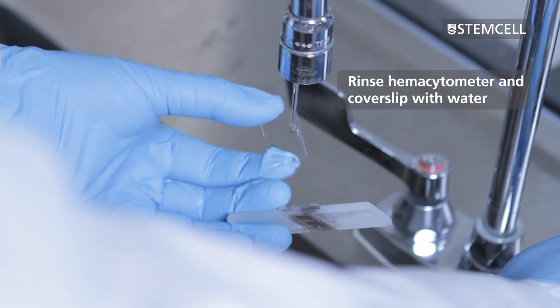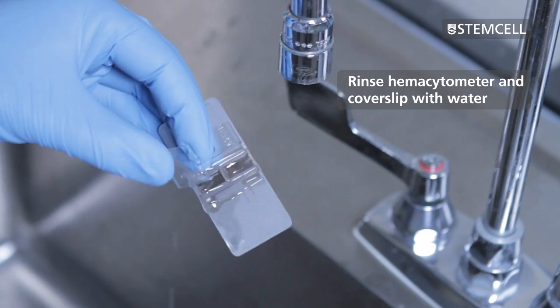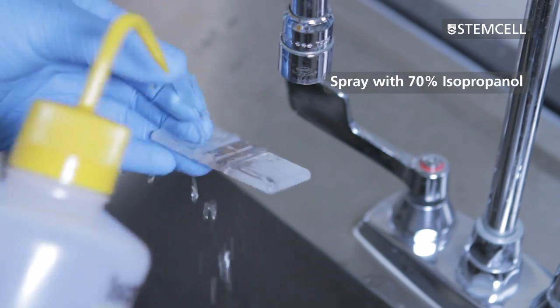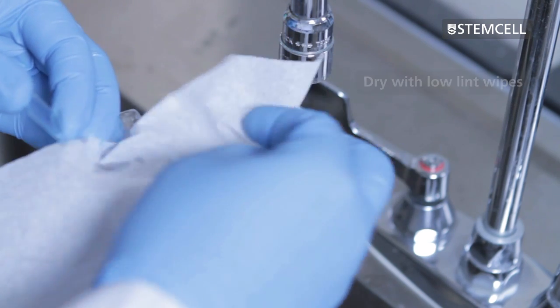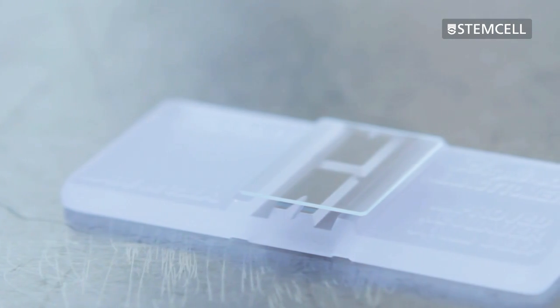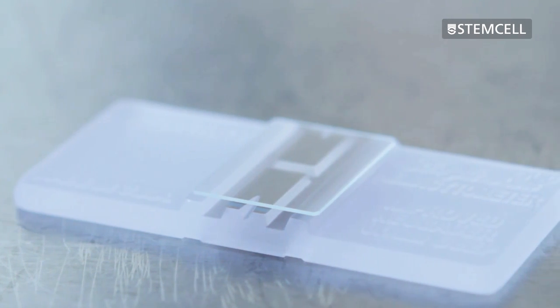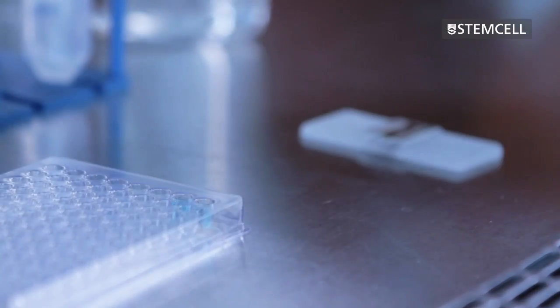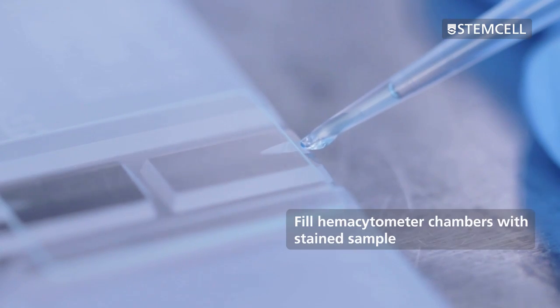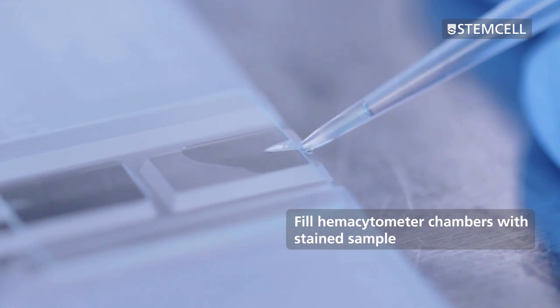Clean a coverslip and hemocytometer by first rinsing it thoroughly in water and then spraying it with 70% isopropanol and drying it with low-lint wipes. Place the coverslip onto the hemocytometer so it is centered over both chambers. Fill the hemocytometer with stained diluted cell suspension by carefully touching the edge of the coverslip with the tip of the pipettor and allowing the chamber to fill by capillary action.